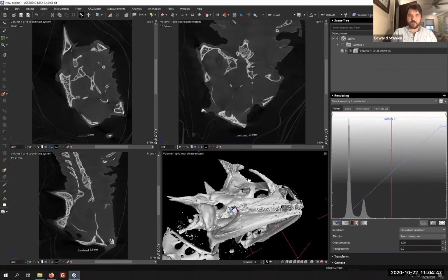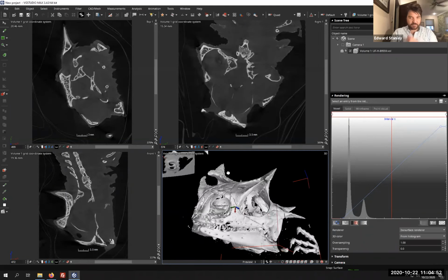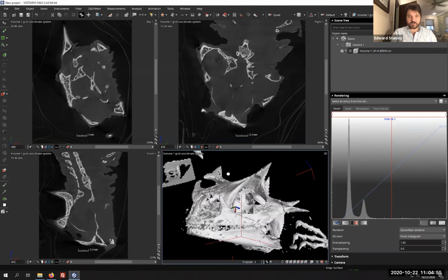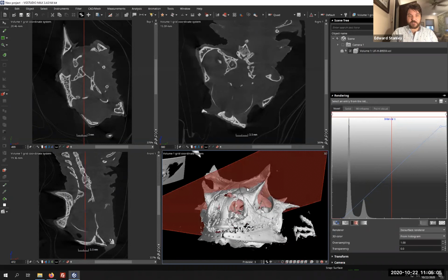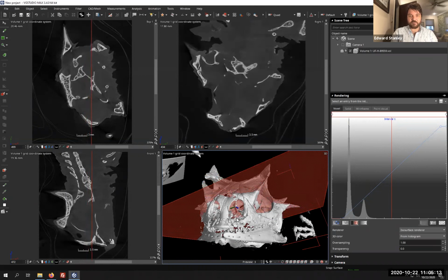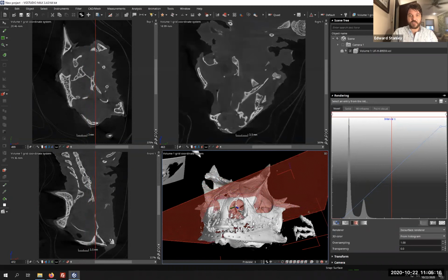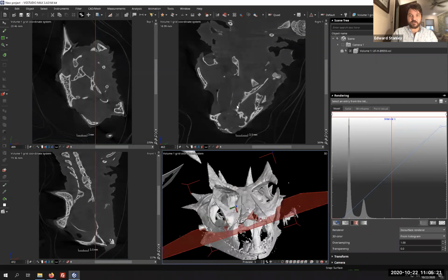And that's a quick way of visualizing your specimen in 3D, assuming that you're interested in visualizing all the dense parts and none of the low density parts. One thing we can do in addition to this is, if you notice, as we scroll through here, that this clipping plane, rather the tomogram slice, is not actually moving in a nice symmetrical way, right? It's not what would be a coronal section on this.